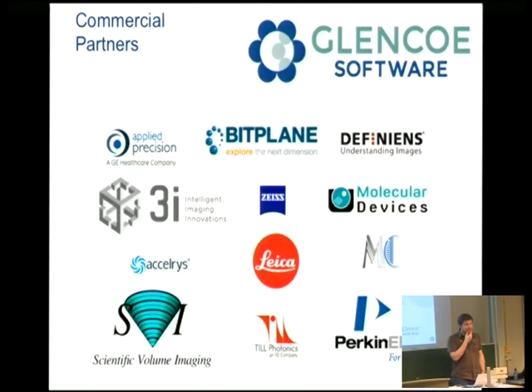But encouragingly, some of the vendors are beginning to use OME XML as a primary acquisition format, that's really great. And all the time we're seeing pressure from all the users of OME software on the commercial microscope vendors and image analysis software providers to support us more, either in terms of just supporting the model, or also in terms of pushing data into OMERO and getting it back out.